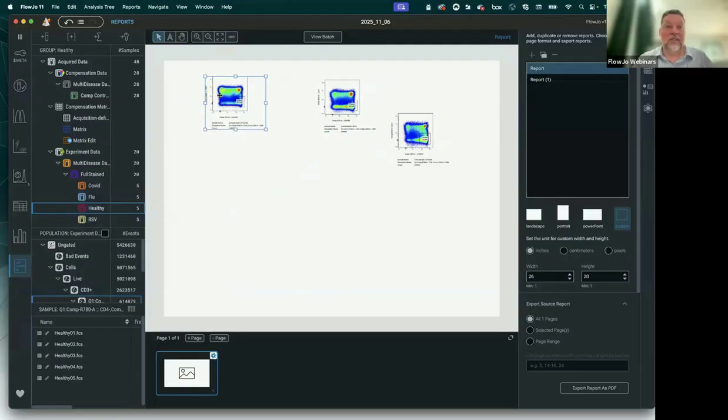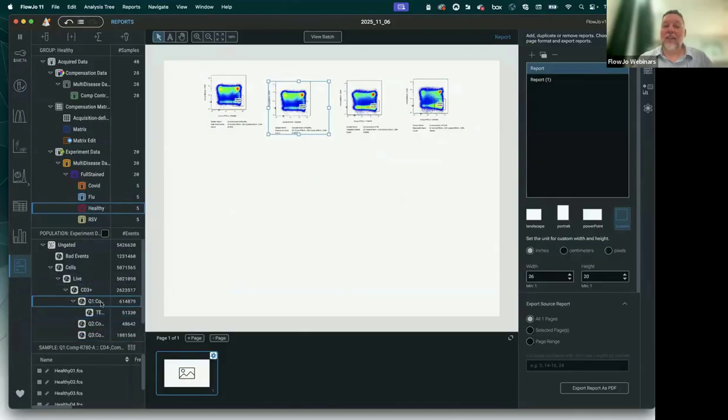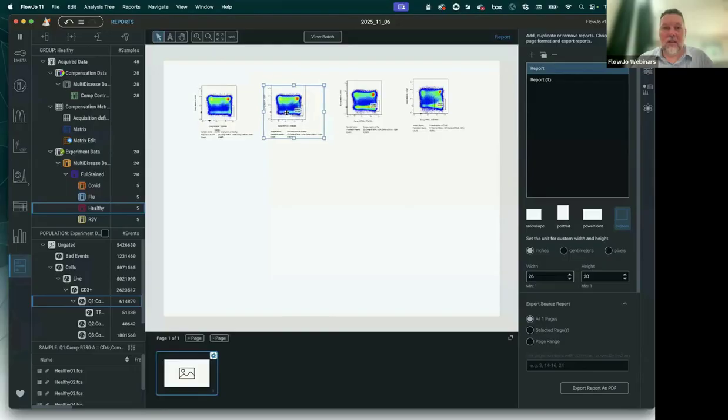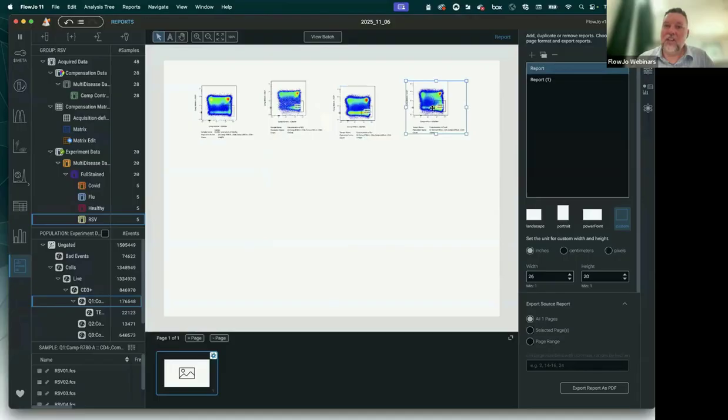So if you wanted to summarize in a virtual concatenation, it's very easy just by toggling on VCP and dragging over that level in the gating. And it's interesting, I can drag the group, I can drag the gate because I'm focused on that gate in the group, but I get the same profile. So this would be a comparison of the summary, summarizing those. Oh, I actually probably picked the wrong group. RSV group. There we go. That's better. Right. And so there's a summary of all 5 patients in a virtual concatenation world.